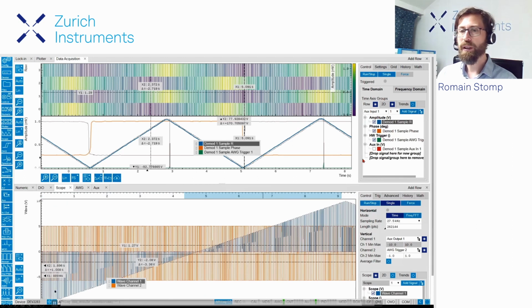And if we zoom, and let me pause one last time here. So basically this gating trigger here corresponds to one of these data captures there. So we have a very nice match between what you write and what you read again.